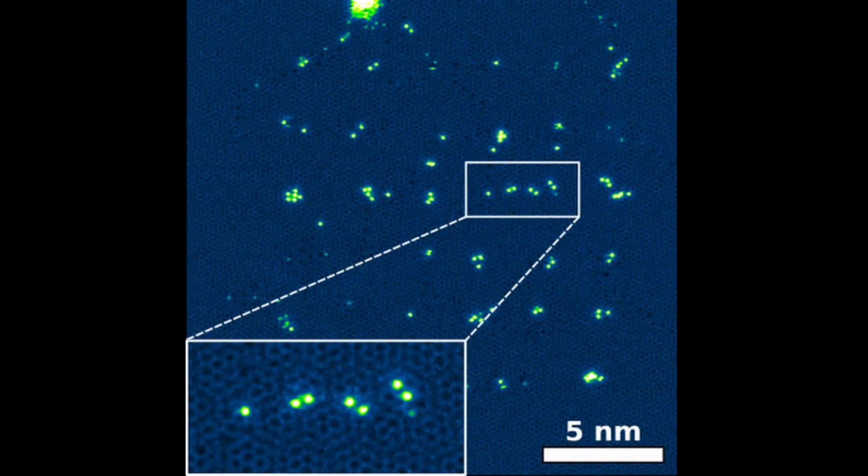The final aspect of this study concerns the role of vacancy diffusion. We can see in these patterns that the array is not perfectly formed, and we know that the mechanism for attachment of the dopant atoms is the creation of vacancies in the lattice, which gives the diffusing atoms a chemically reactive attachment point in the substrate.